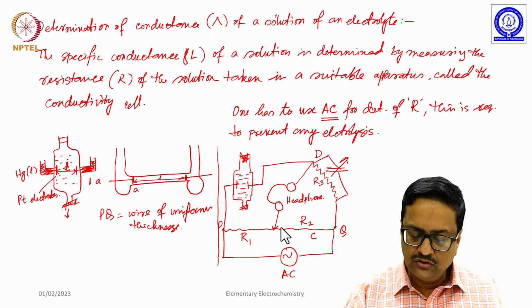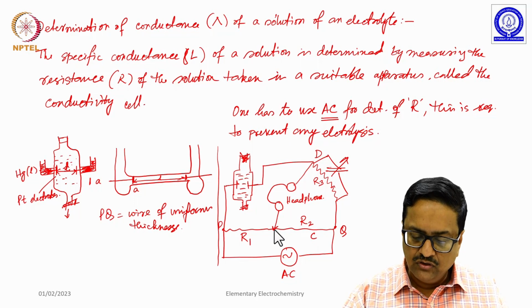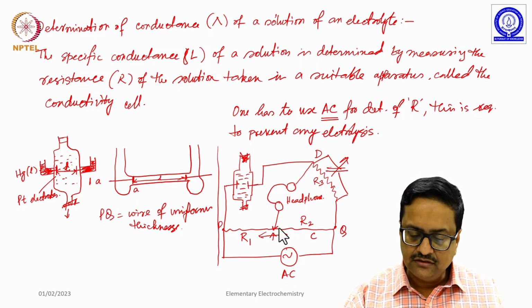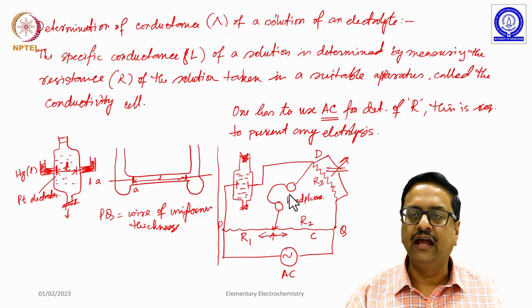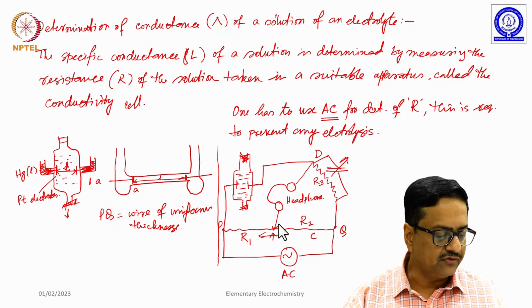With the help of this headphone we keep this variable point moving left and right, such that at one point no sound is heard in the headphone, which will indicate the point of equivalence.